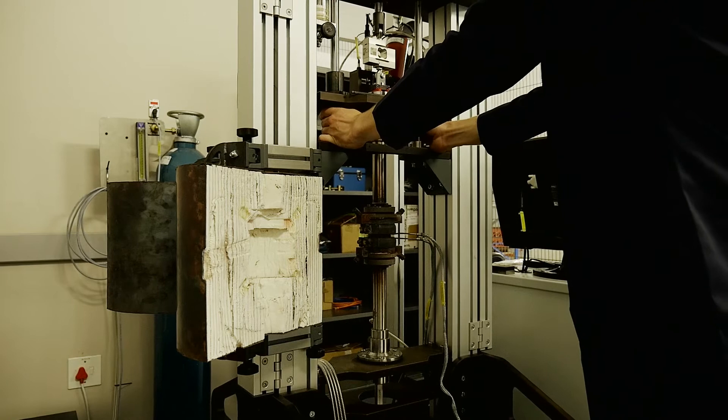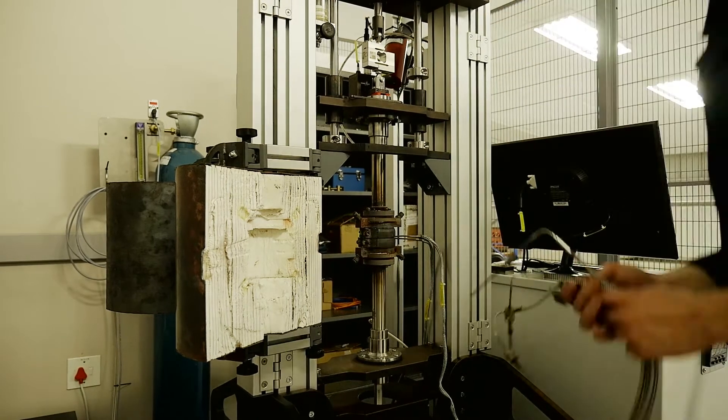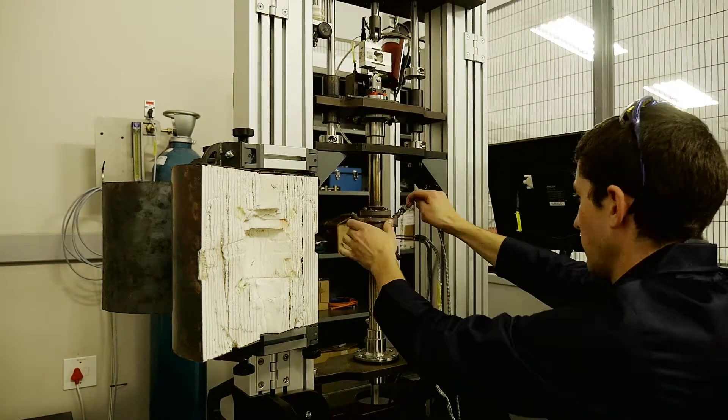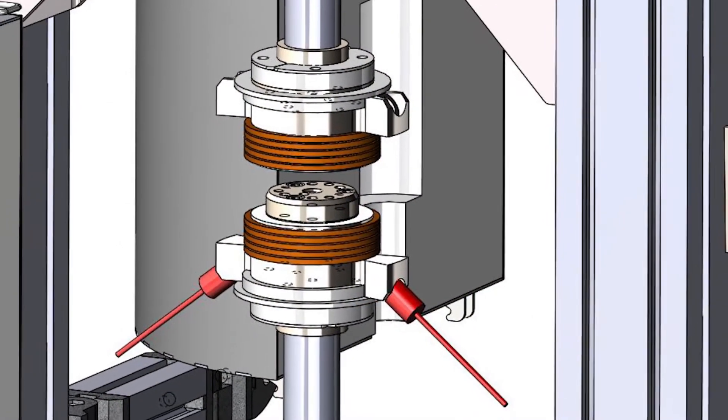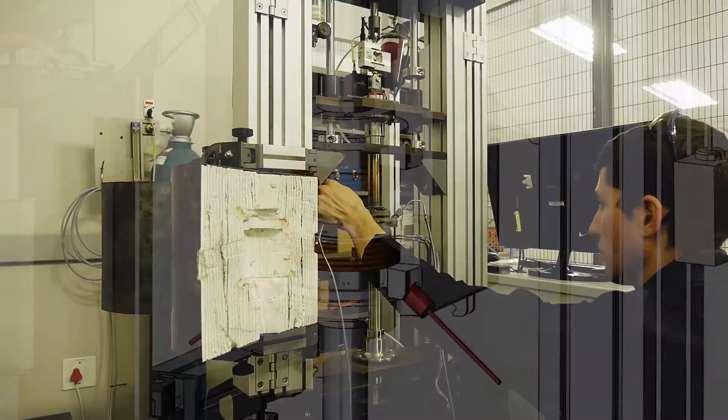This process continues until the sample eventually ruptures after hundreds to thousands of hours.